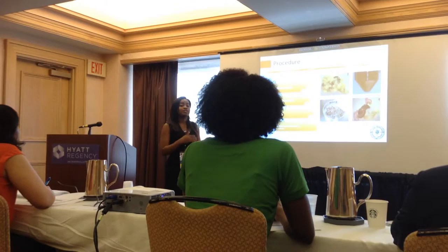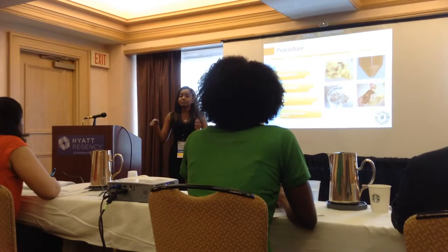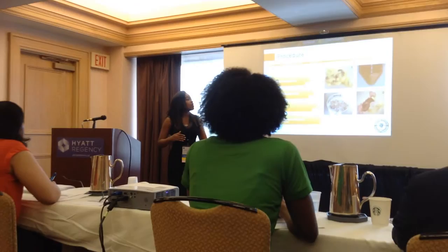So I had to be very careful and once again develop that aseptic technique. And when I grew this bacteria, it usually grows very slowly because it has a lot of genetic information. It doesn't grow as fast as something like E. coli. It takes about 2 to 3 days to grow. I had to breed this to grow overnight.